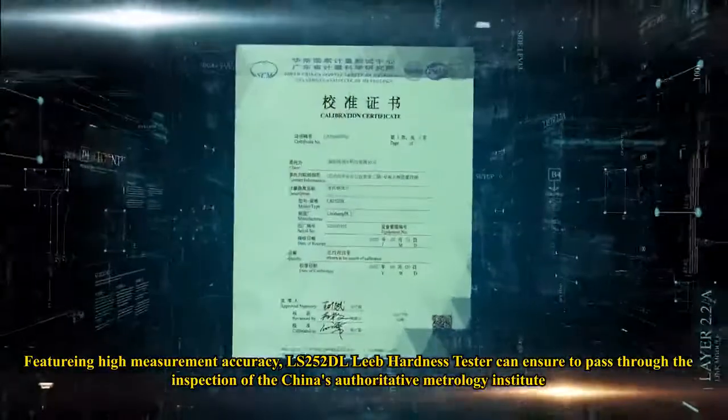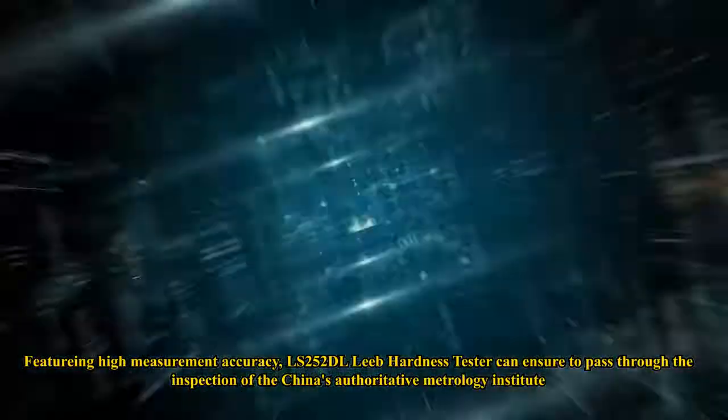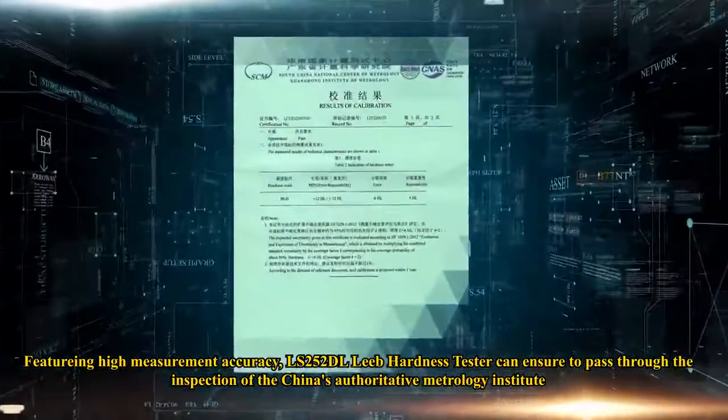Featuring high measurement accuracy, the LS252 DL Leeb Hardness Tester can ensure it passes the inspection of China's authoritative metrology institute.